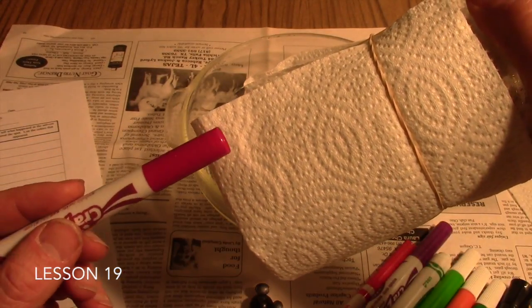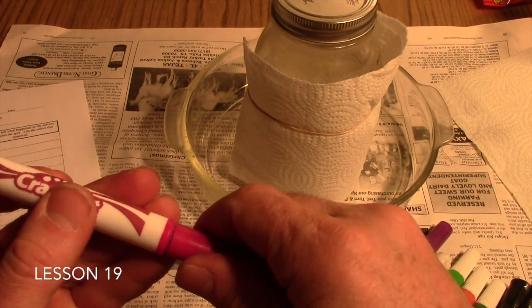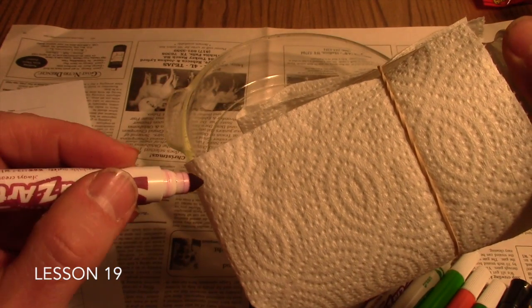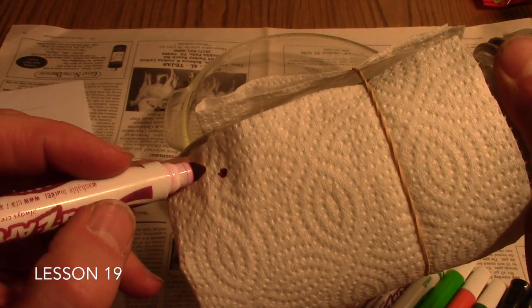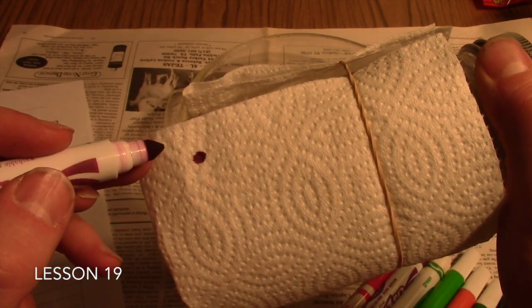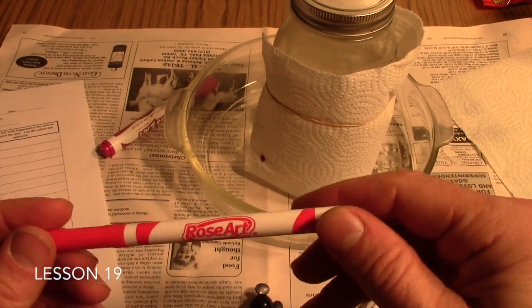The next step is to make a series of spots of ink around the lower edge of the paper towel. Now, you don't want to hold the ink tip onto the paper towel because the ink will just be drawn up into the paper towel and you'll end up with a great huge spot. So instead, we'll come up about an inch from the bottom edge of the paper towel and we're just going to touch the paper towel, let the ink dry, and touch it again, let it dry, and we'll repeat this until we get a very concentrated spot of ink on our paper towel. Then we'll go to the next marker in our pile.